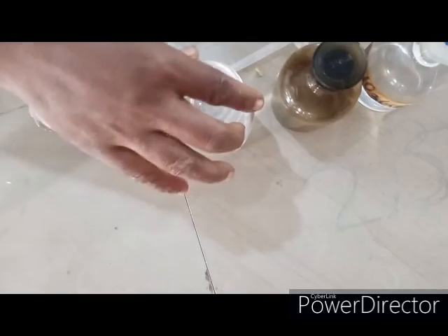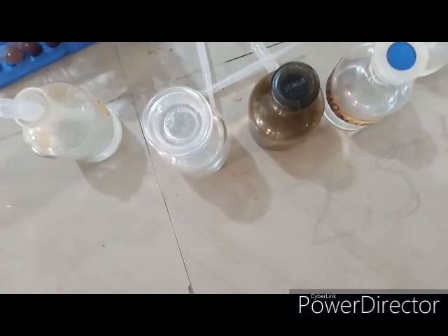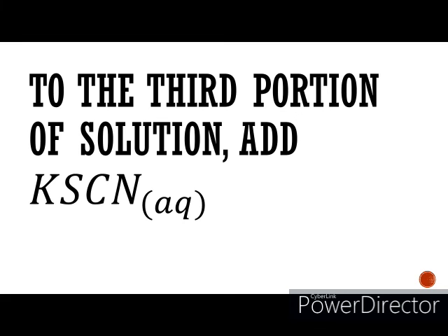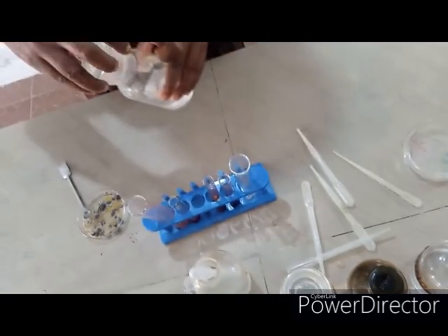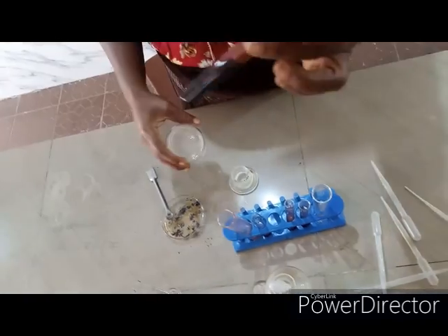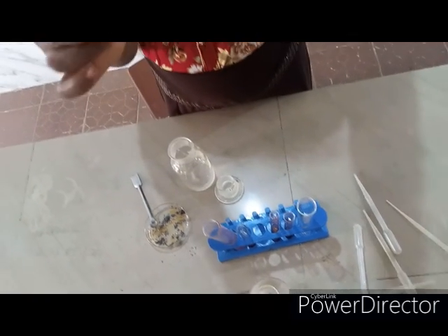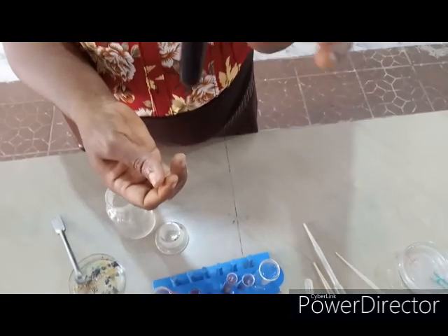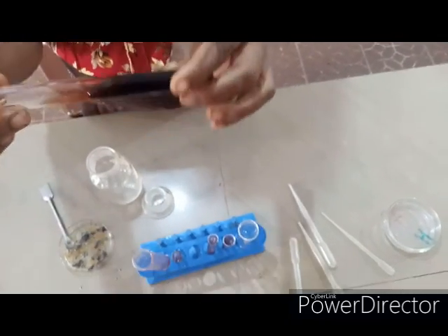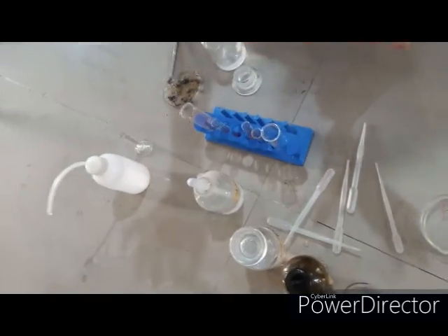The cation present in this salt is iron 3 plus. To the third portion of the solution, there are other confirmatory tests for iron 3 ion — we are adding potassium thiocyanate. What do you observe? The solution turned blood red. That is our observation and iron 3 plus is confirmed. This is another confirmatory test for iron 3 plus. When you tilt your test tube, you see that there is a blood red coloration.